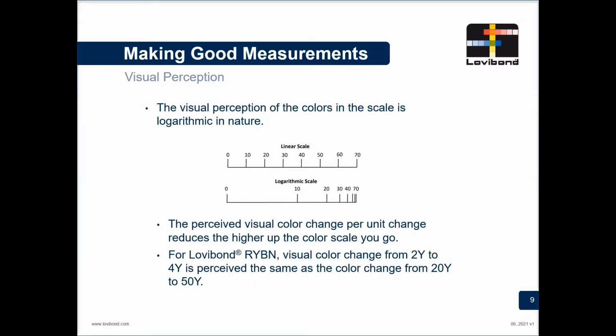It might see that as about 1.5 times the amount of color. So this means that as you double up the path length, you don't have this linear response. You have a more logarithmic response.